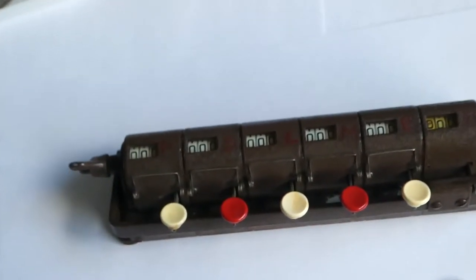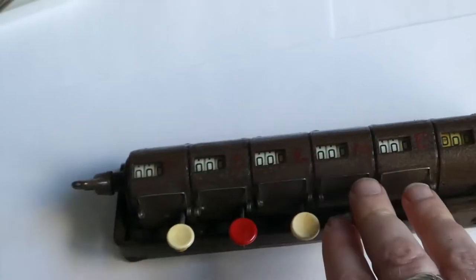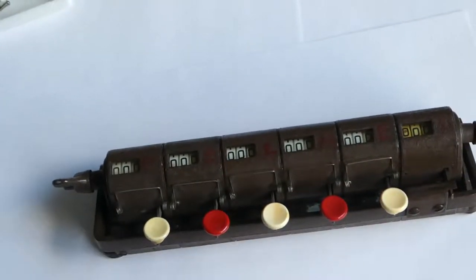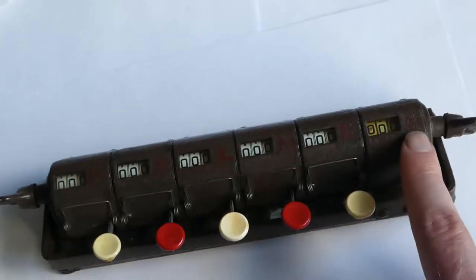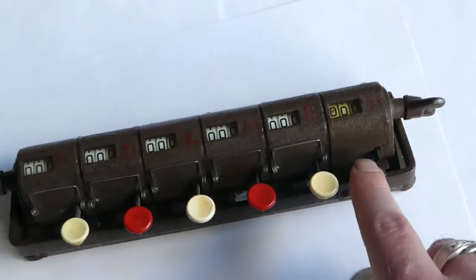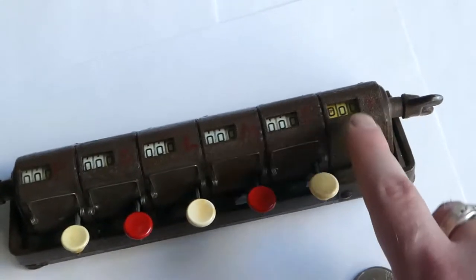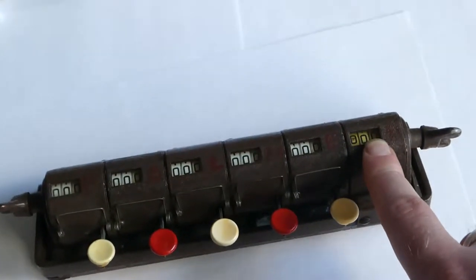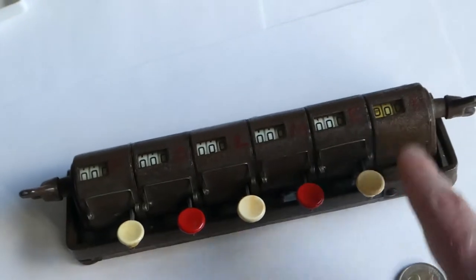In a lab situation you'd use this to count five different outcomes of samples, and normally there would be a locking mechanism in the total that causes this button to lock up when this reaches 100, but that has been disabled on this one.